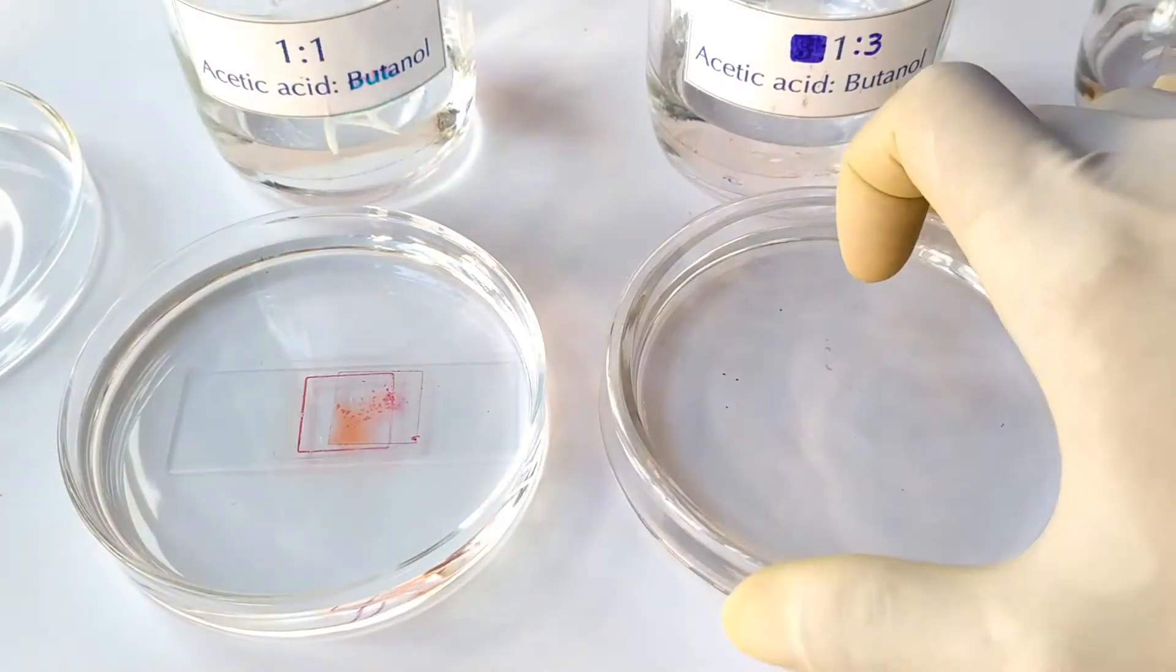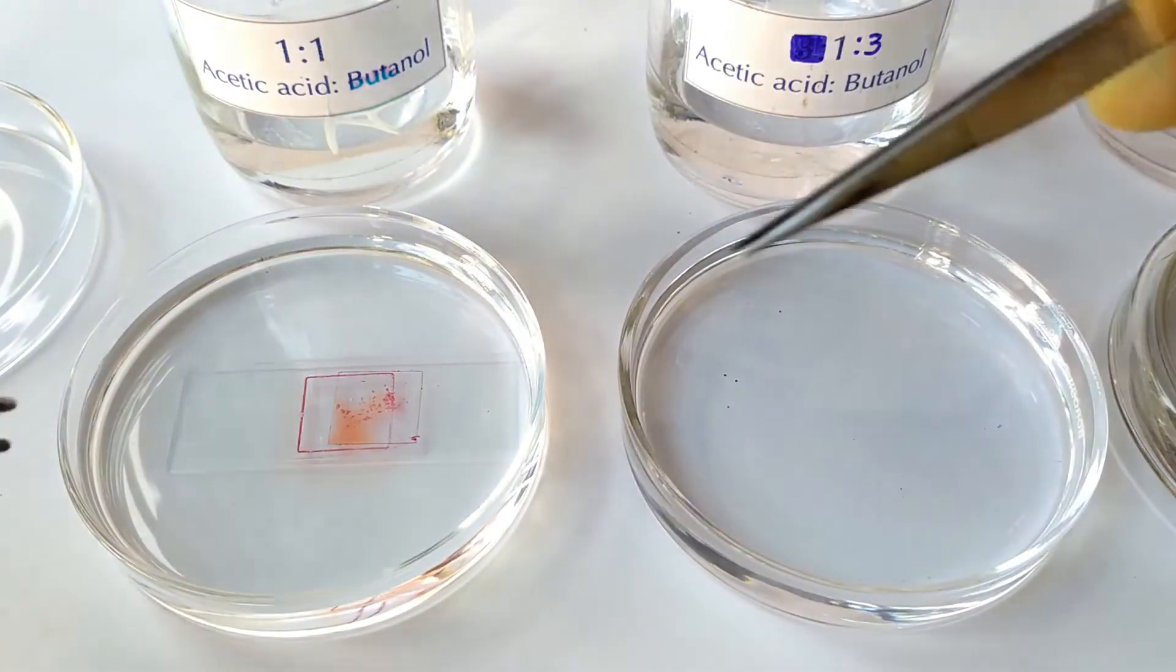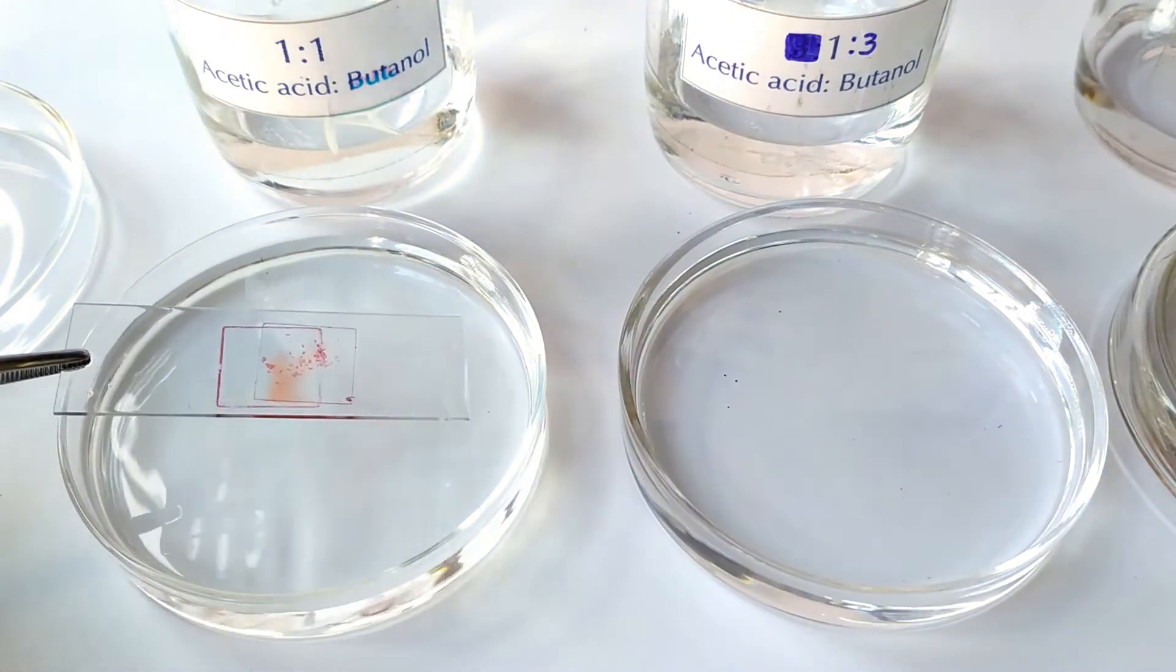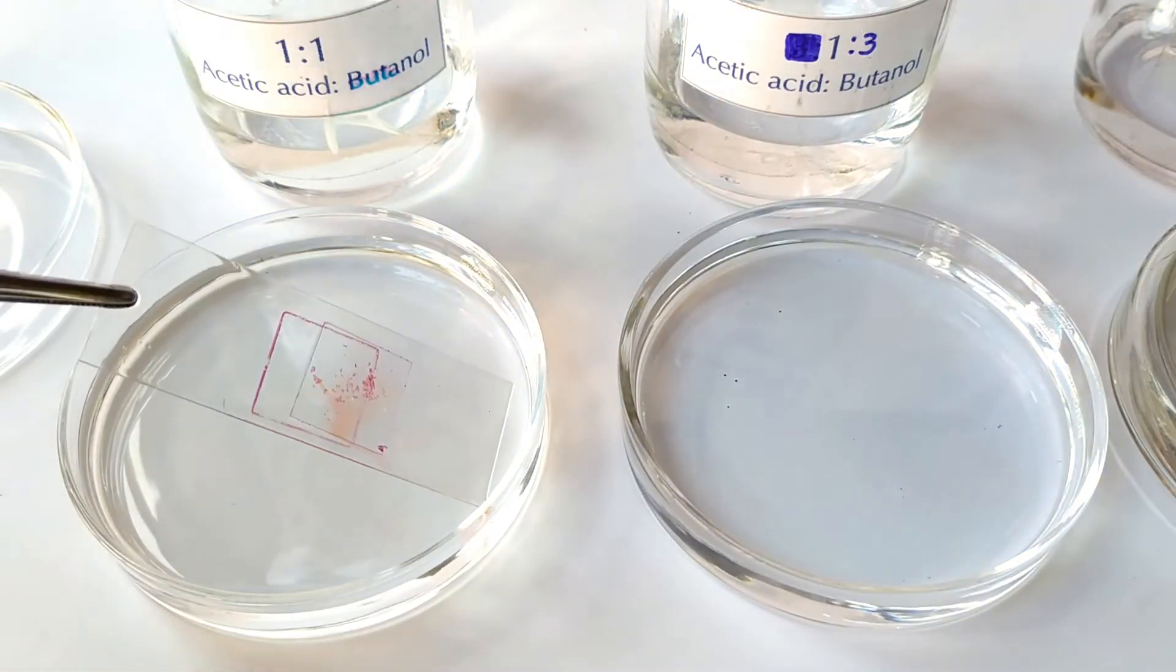Now transfer the slide and cover slip into a second petri dish containing 3 parts of butanol and 1 part of acetic acid and leave it immersed for another 10 minutes.